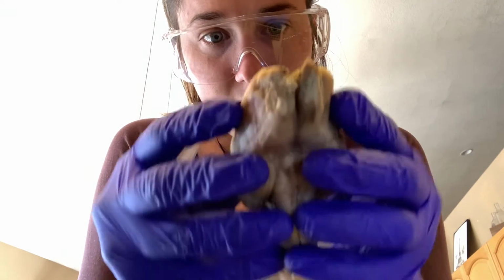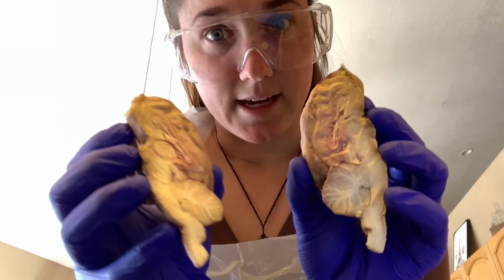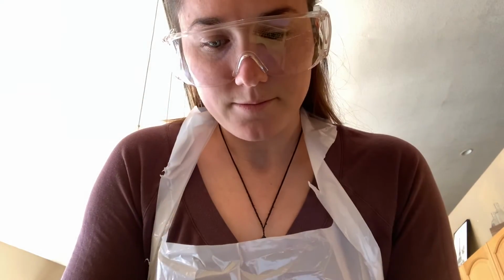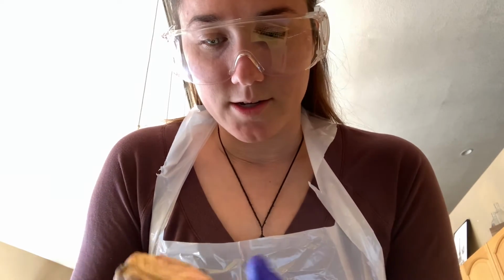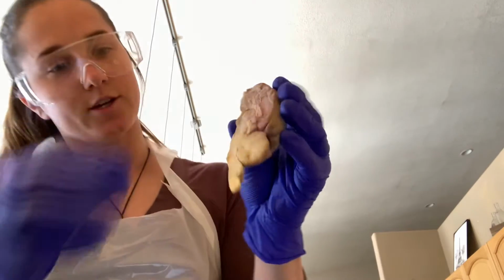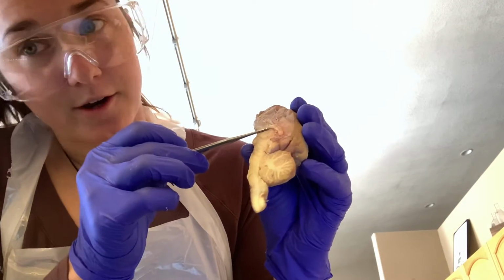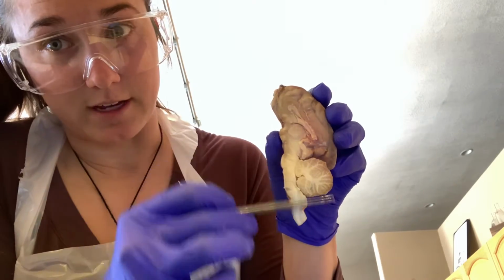Now, if we make a cut in the middle of the brain, we can open up the brain and see the internal structures of the brain. And so, starting inferior to superior, we have the different structures of the internal brain.